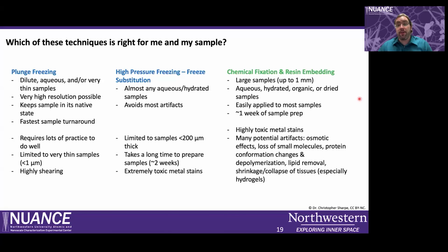Finally, chemical fixation and resin embedding, you can look at the largest samples and you can look at the largest diversity of samples. So aqueous samples, hydrated samples, organic samples, dried samples, all of these can really go through a chemical fixation workflow. It has the advantage of being about a 1 week turnaround for chemical fixation and resin embedding. And most of that time is the sample slowly being infiltrated with your fixative. So it is really only about 1 day of work and then several 1-hour sessions over the course of 4 days to kind of finish up the process.